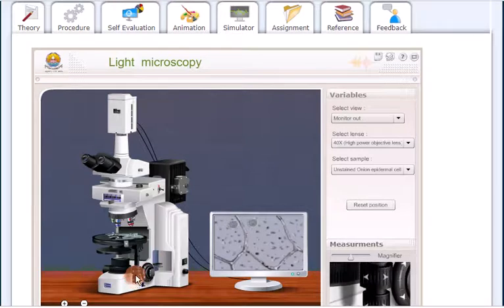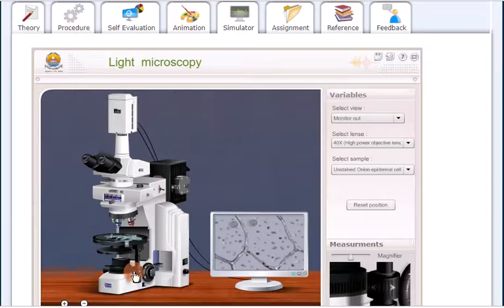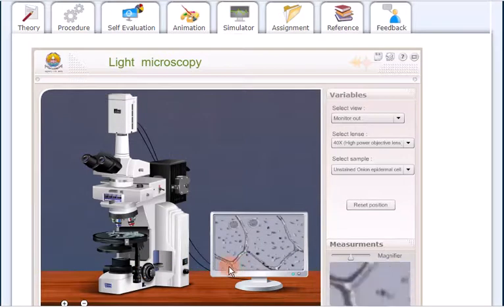Okay, can you see there, just above that it is moving towards, and this is for moving. Look at the stage, it is moving. So this is very important that you move up, down, or move up. So you can do this to move your slides up and down. Okay, this is the area, you know how to use the computers. So this is one thing that you can record.